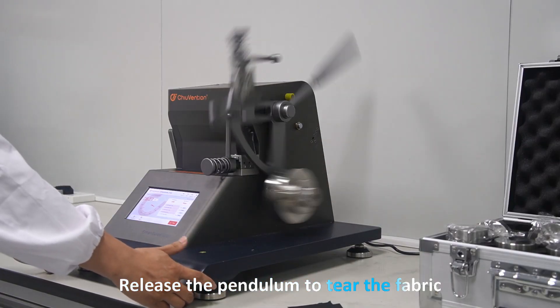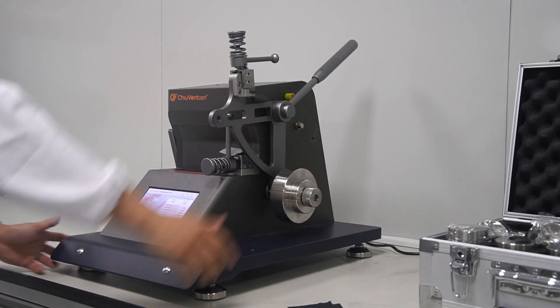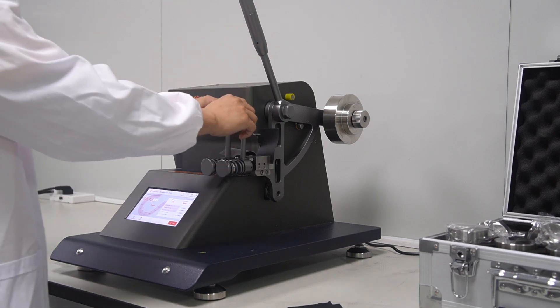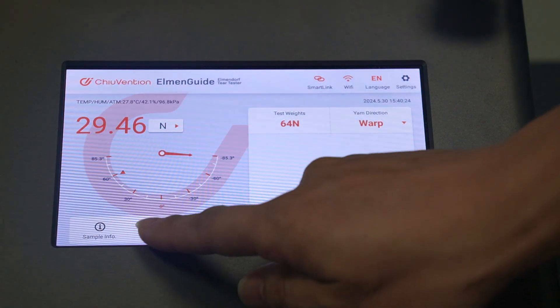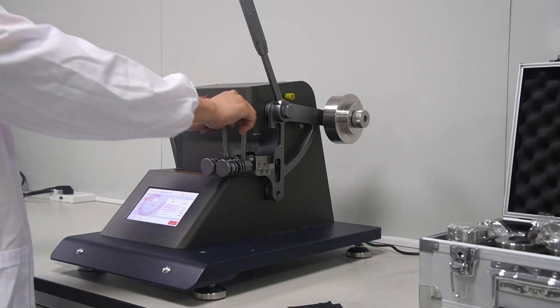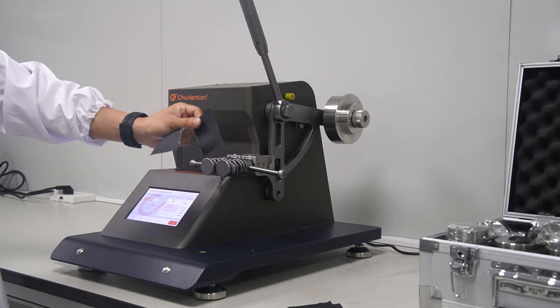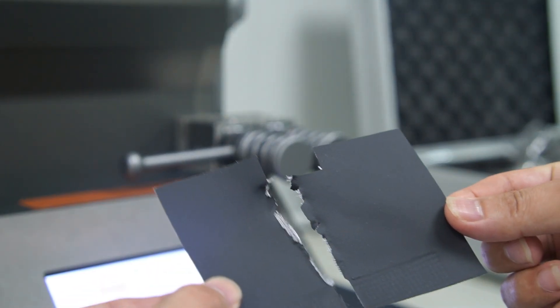We release the pendulum to tear the fabric. Once it's done, we catch the pendulum on its return swing to avoid disturbing the pointer. We then read the result from the scale or digital display. It's important to check that the tear happened in the central area of the specimen. If it didn't, we discard that result.